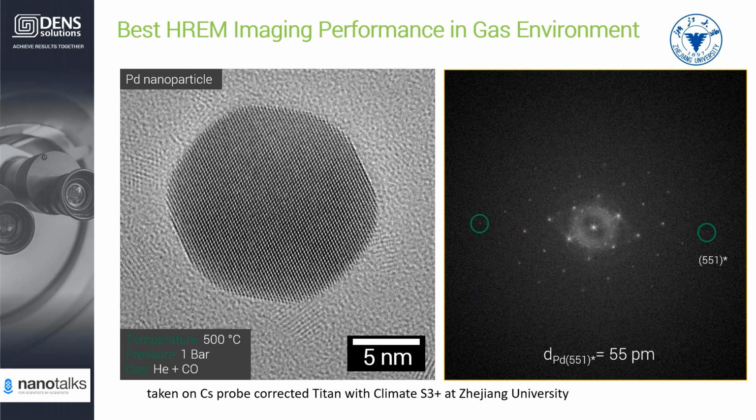Well, actually, on the gas traveling time, it partially depends on the setup, like how long your connecting tube is, and what the gas type is. But practically, this of course also depends on your nanoreactor design, right? So like I said, our direct flow design is like completely opening the door to let the air be refreshed. But if we have something like our old liquid system design, we let the gas disperse from the surrounding channels and gradually to the sample area.